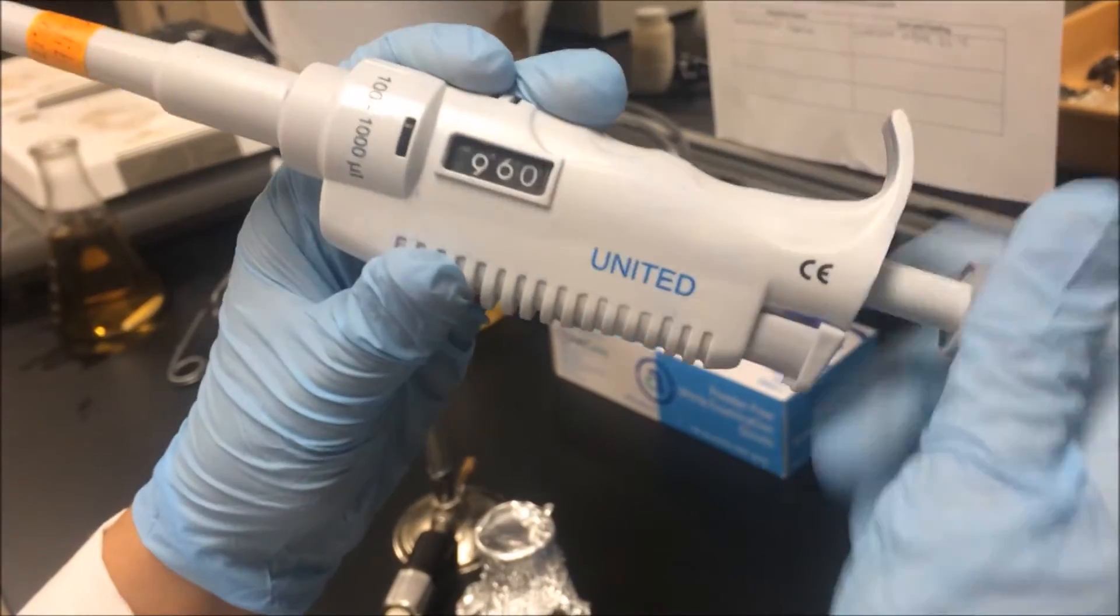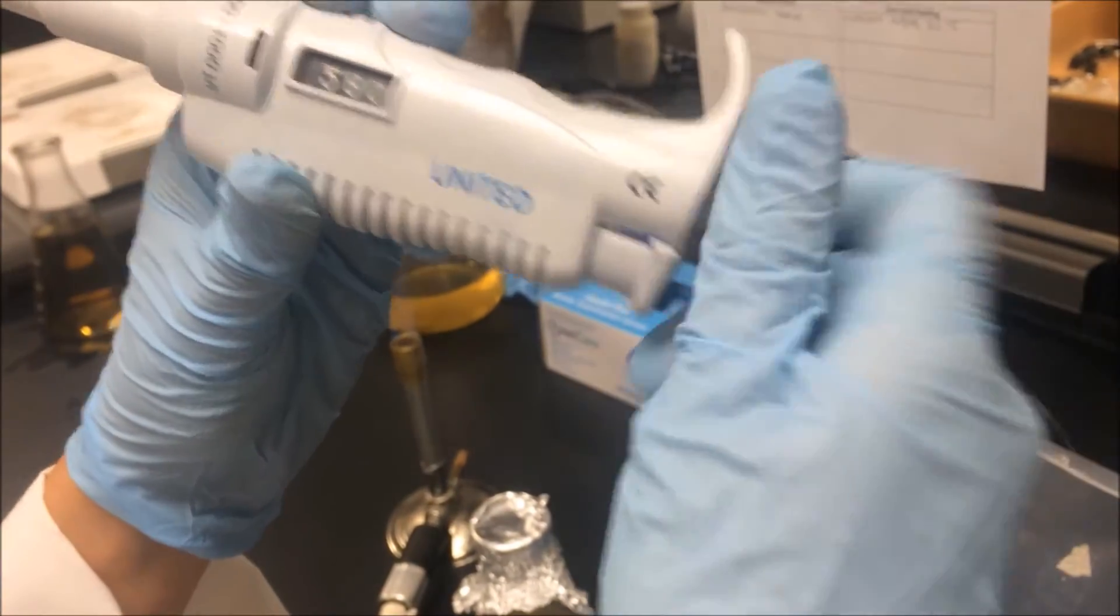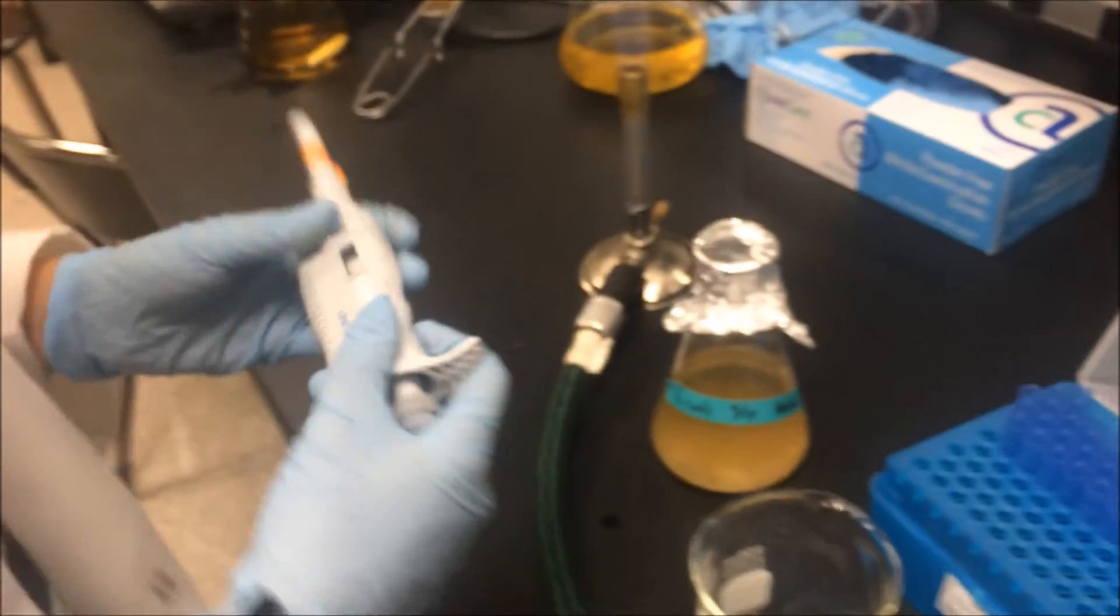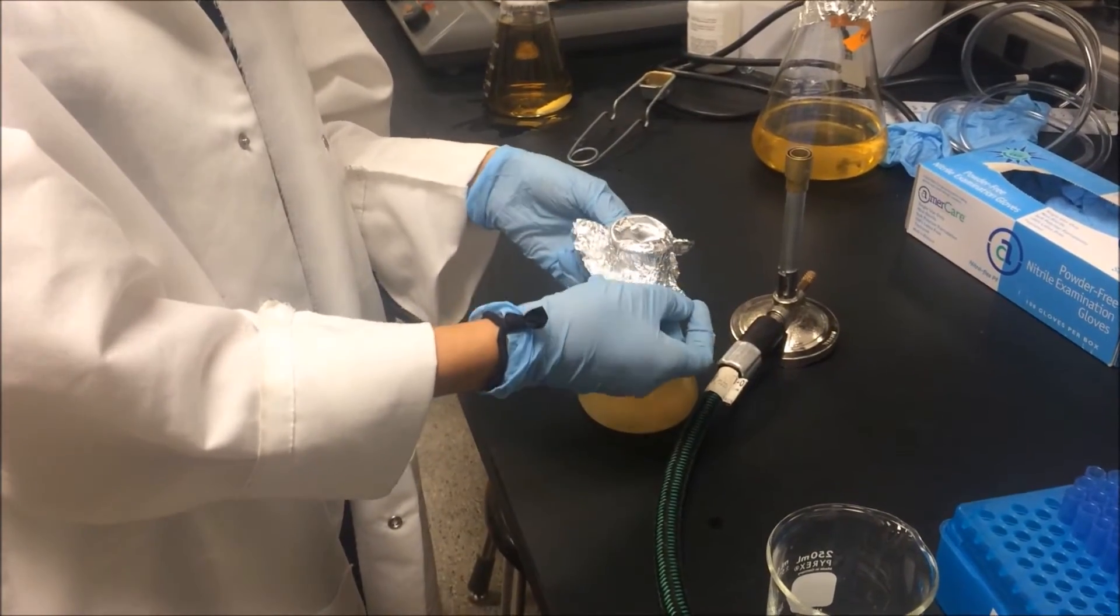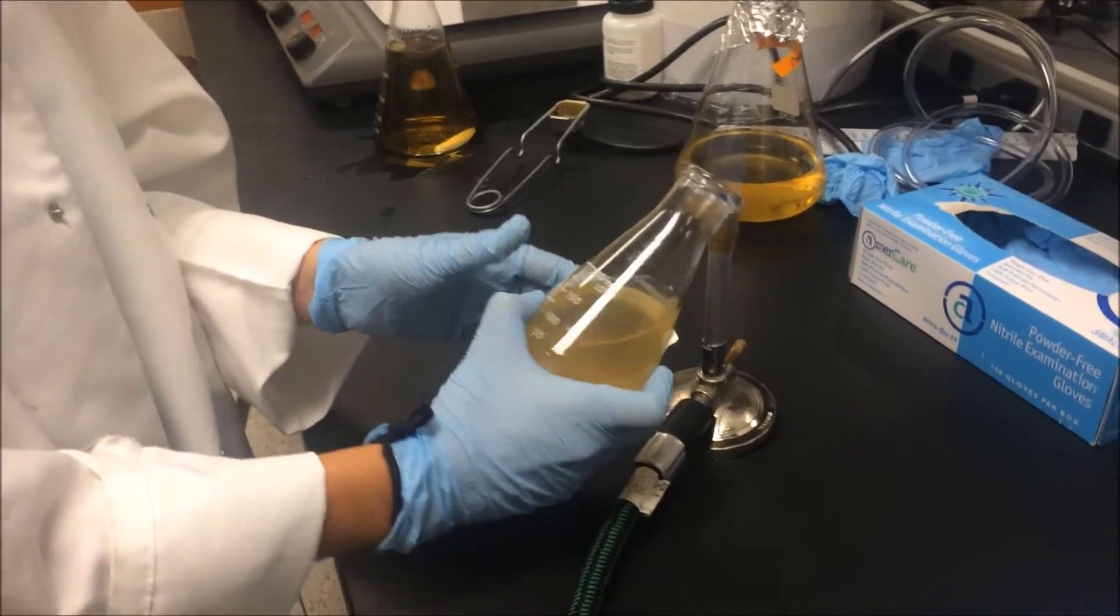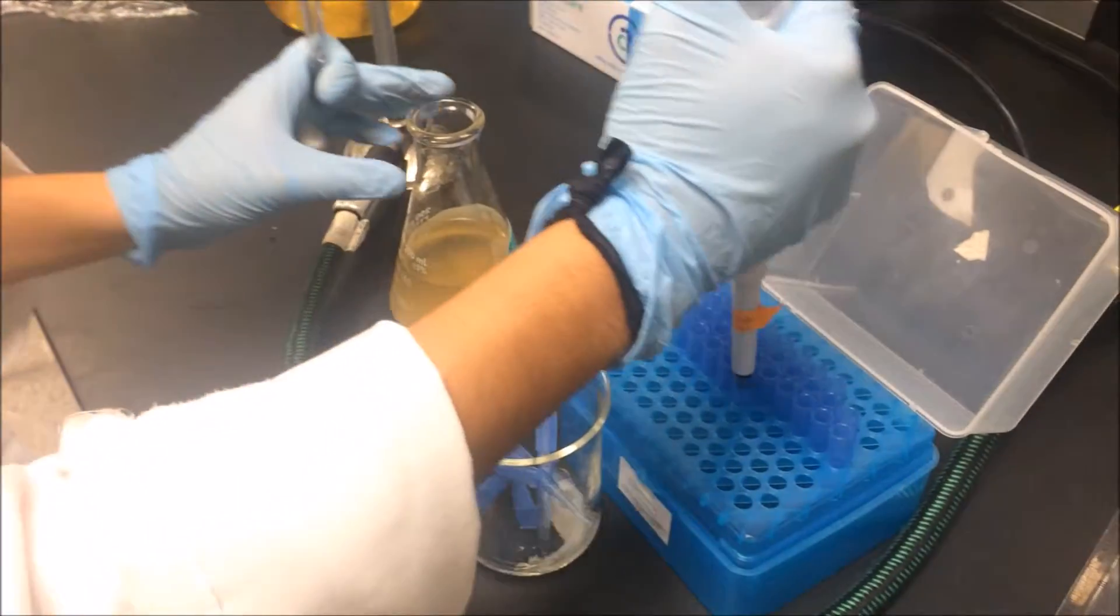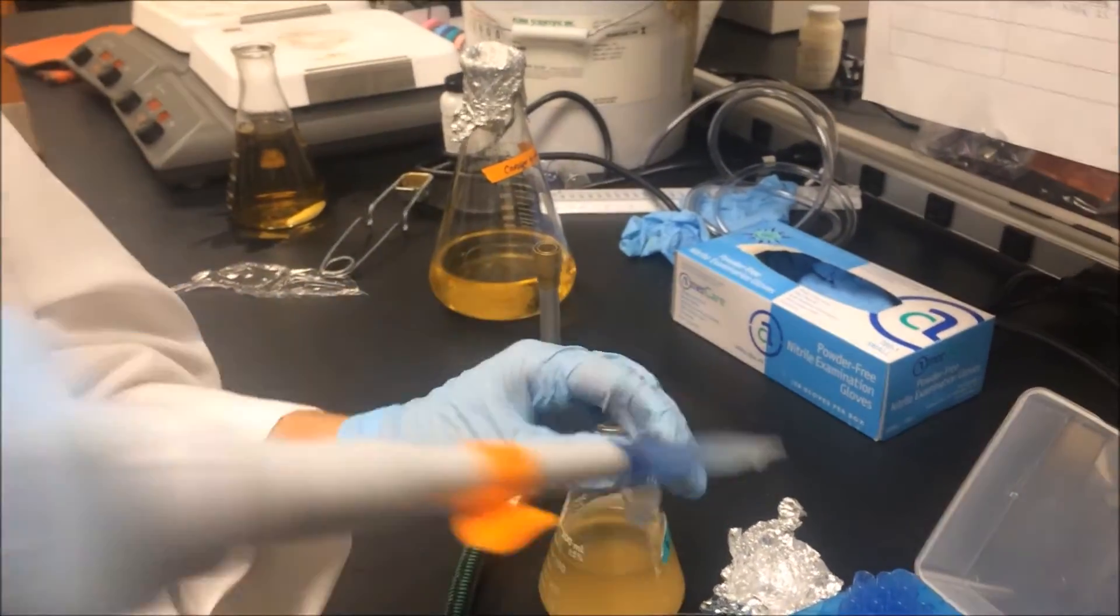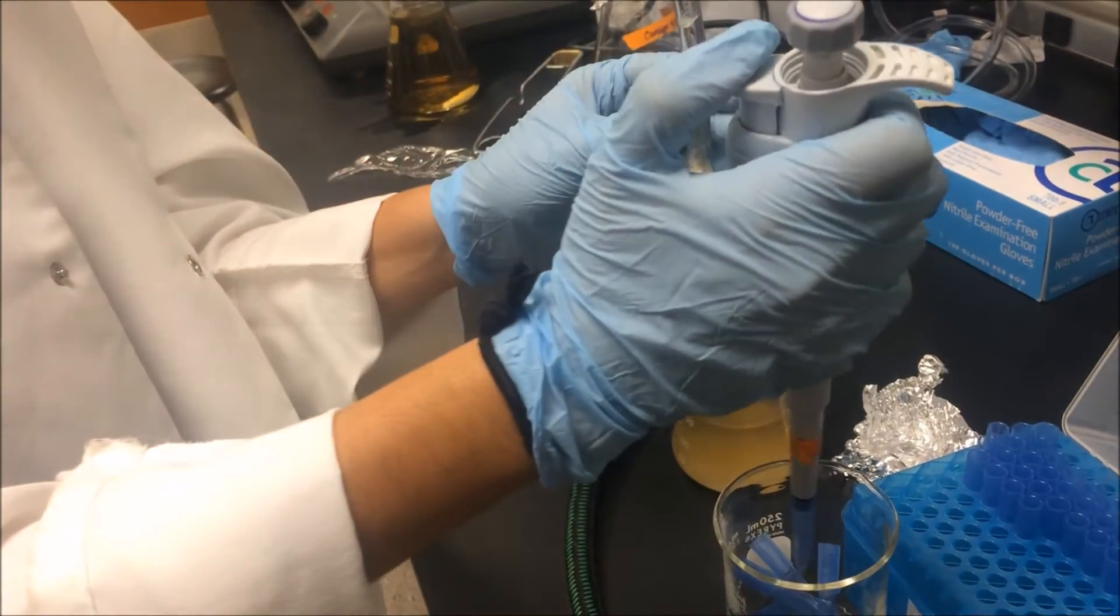Turn to 500. Grab E. coli. Remove lid. Flame. Get new pipet tips. Discard pipet tips.